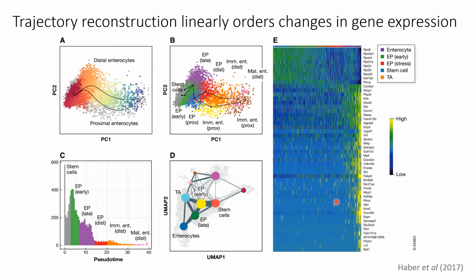However, there are other ways. There's different kinds of pseudotime algorithms that take a different approach. And one is called PAGA, which is implemented in ScanPy and shown in figure D here. So instead of forcing cells to line up in some sort of graph, PAGA quantifies the probability that two different clusters are related to each other by estimating the density of shared nearest neighbor edges. So here, in addition to viewing the clusters, we get some information about the probability that different groups of cells are more closely related, which is represented by the thickness of these edges between nodes.